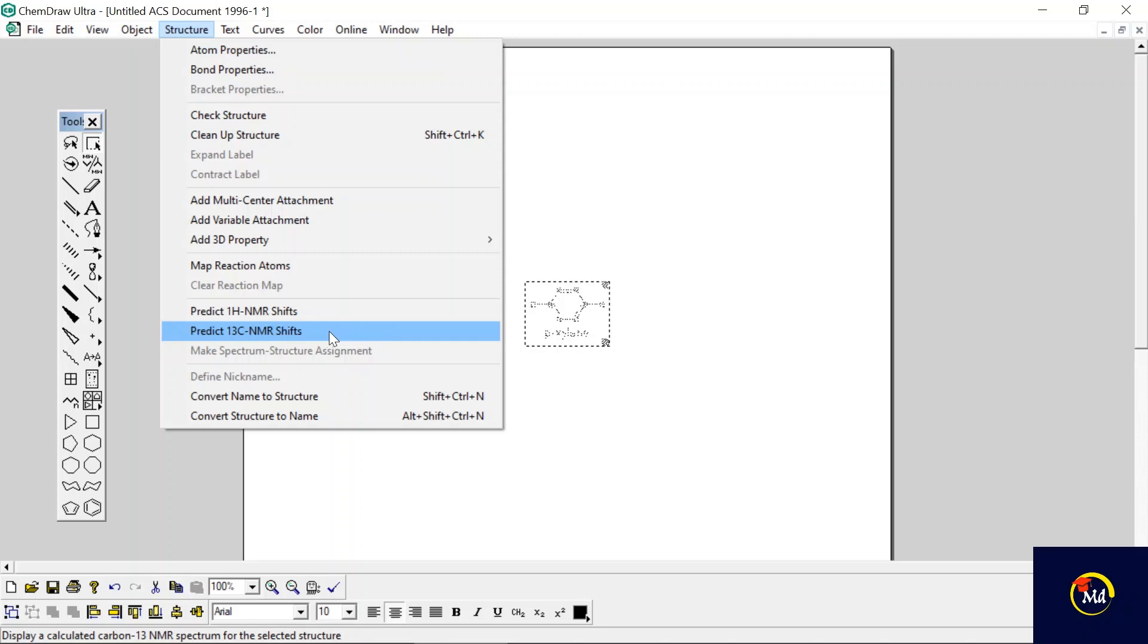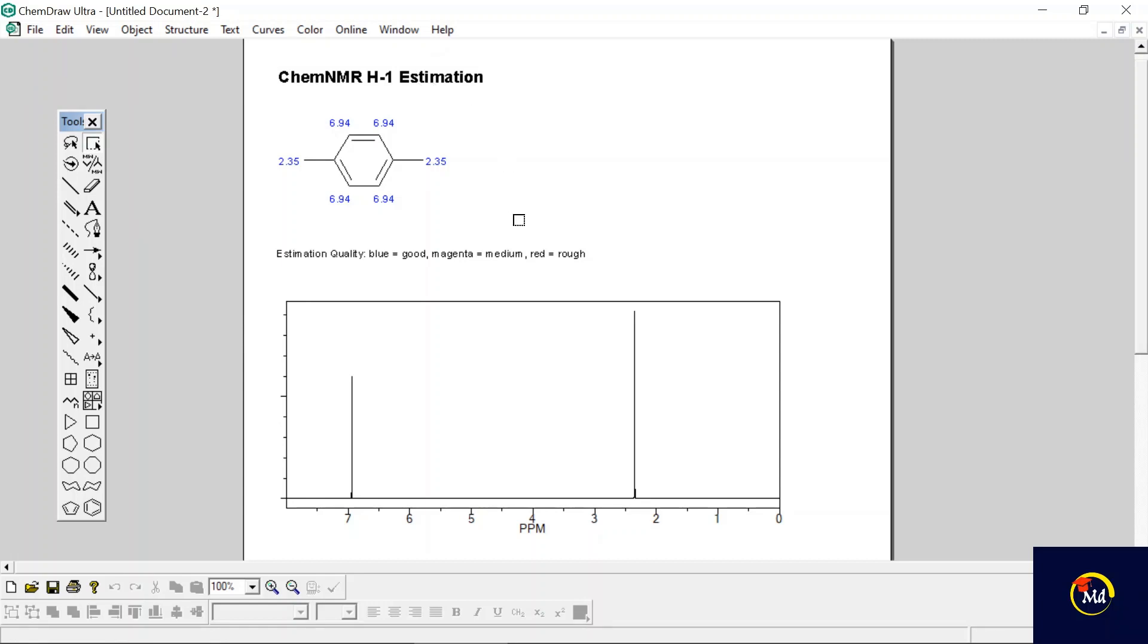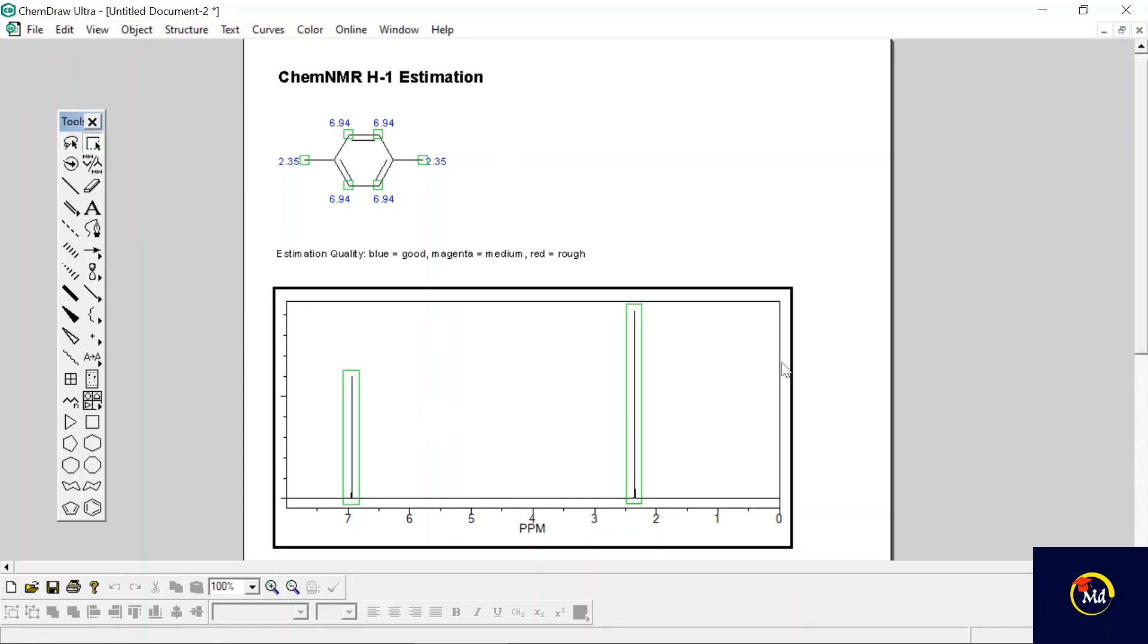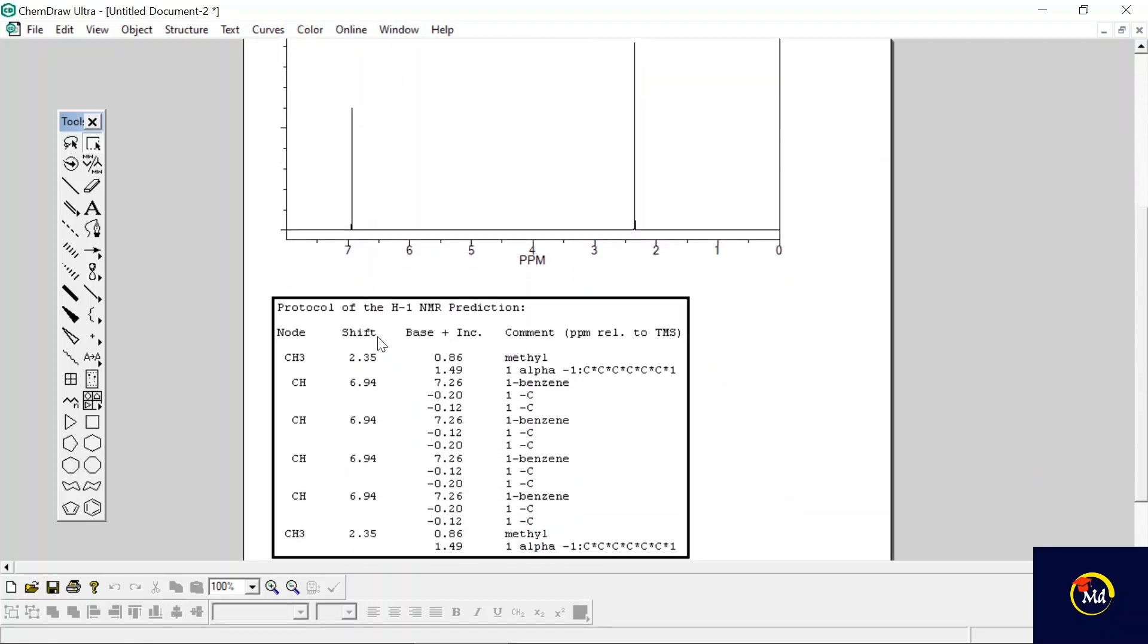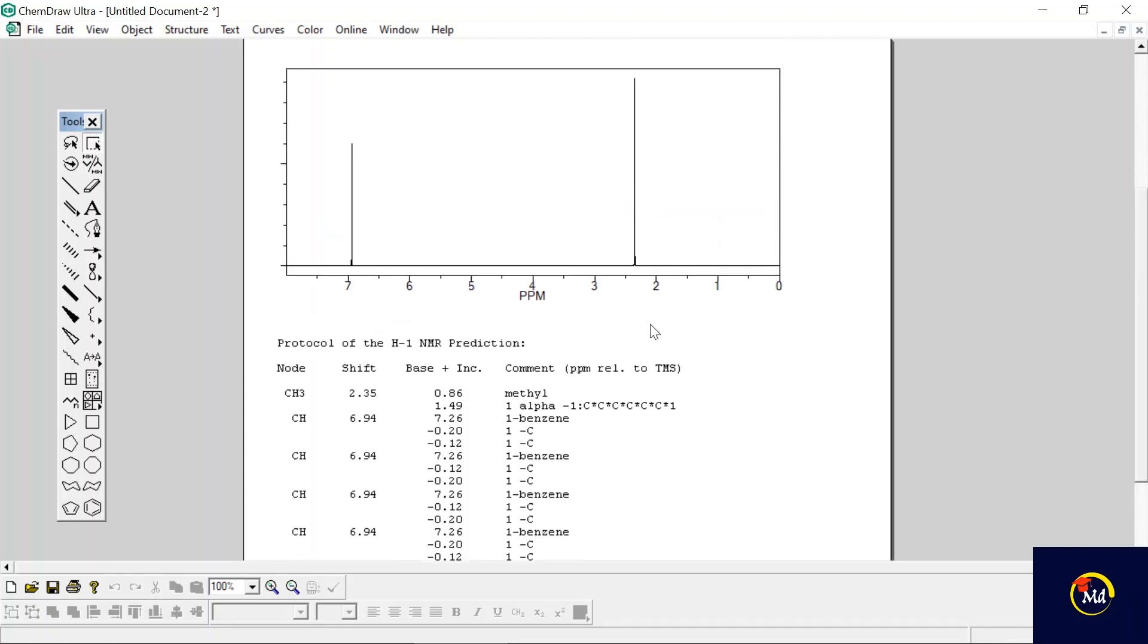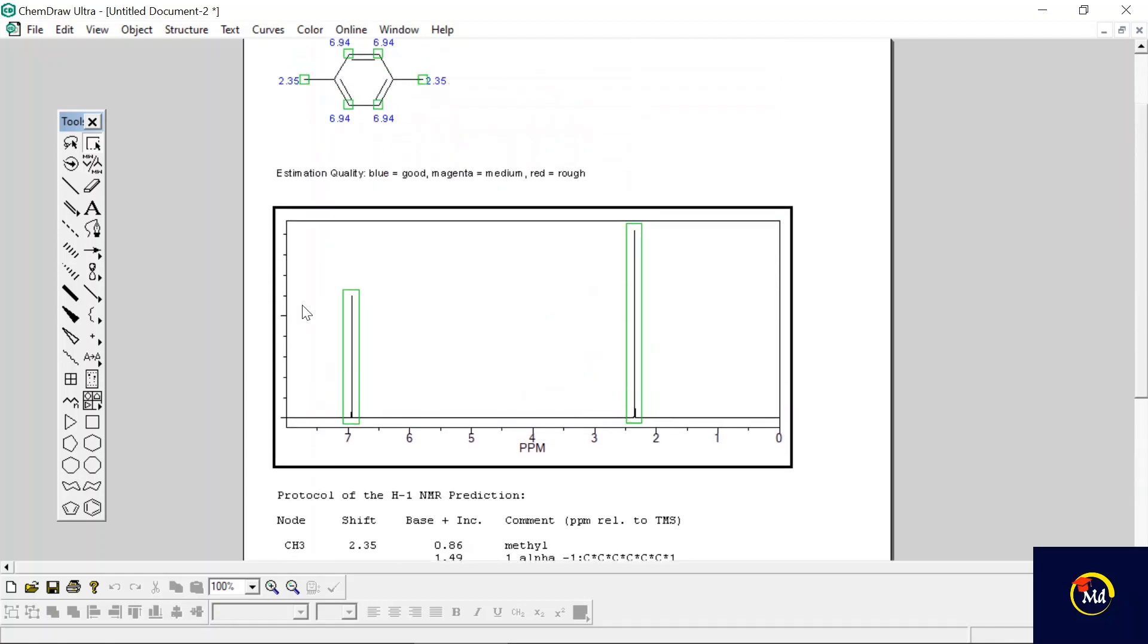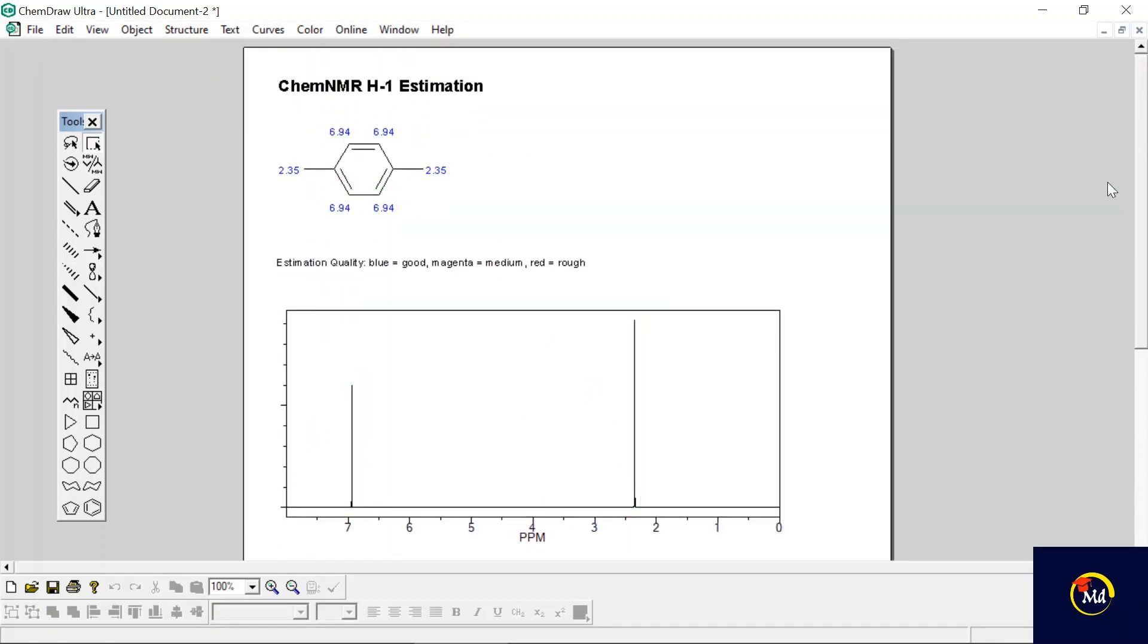Now you can see there are two shifts for para-xylene in 1H NMR estimation. These are the two shifts, and this is the table showing the number of shifts. This is particularly one 1H NMR shift.